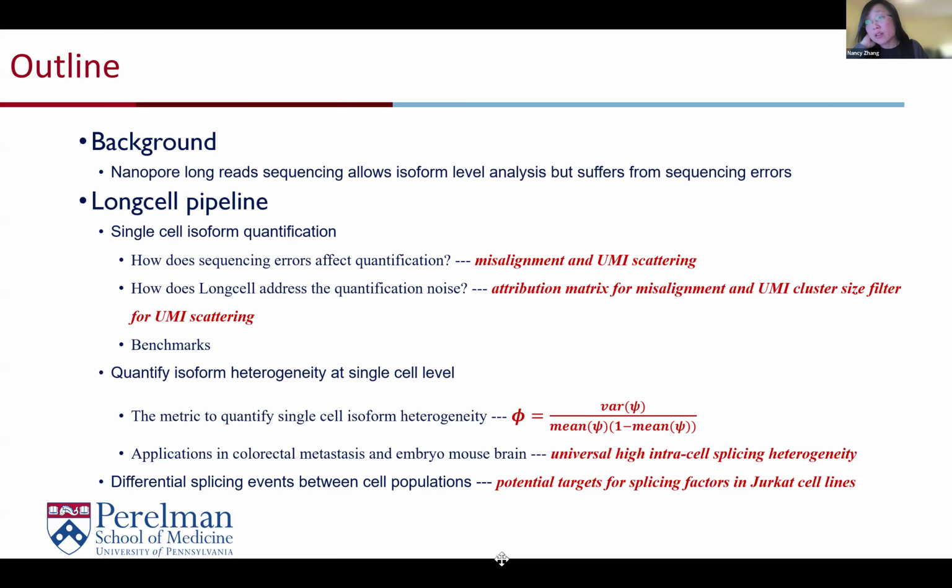you don't get that. Of course, it also depends on cell number. You can imagine, you have many cells, and then you aggregate across cells. We didn't have a high cell number either. So there's a lot to be desired right now in terms of the state of the data. With targeted sequencing, we can get enough counts per gene for those targeted genes, and that was much better. We can actually say something meaningful about their splicing and isoform expression.